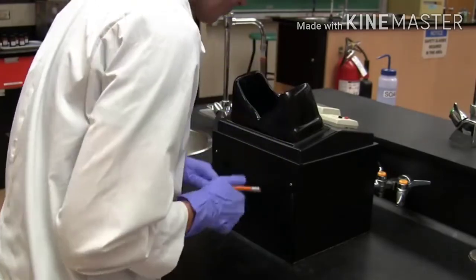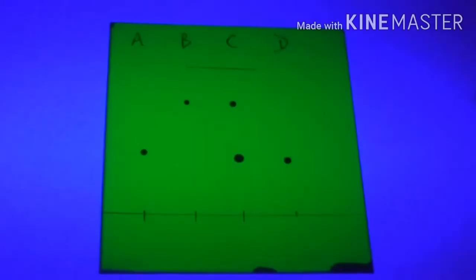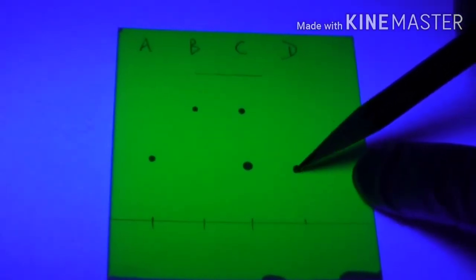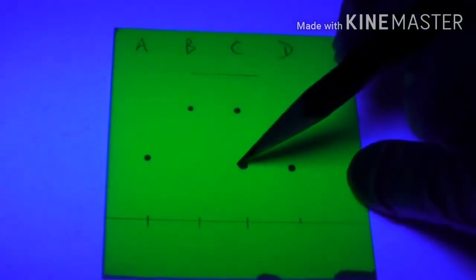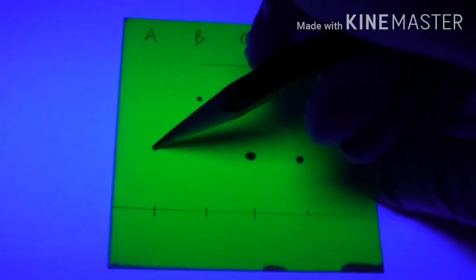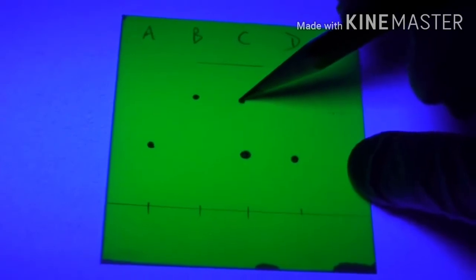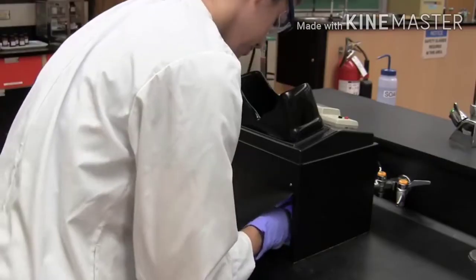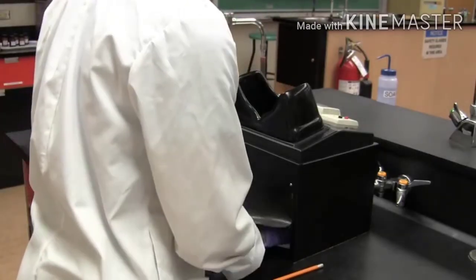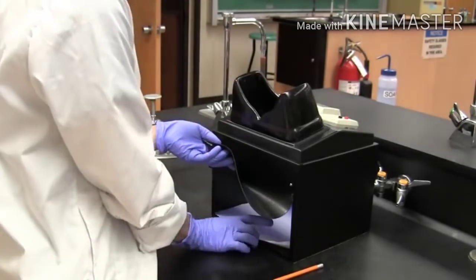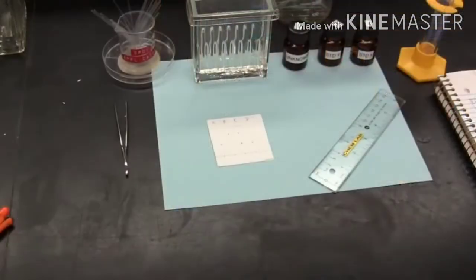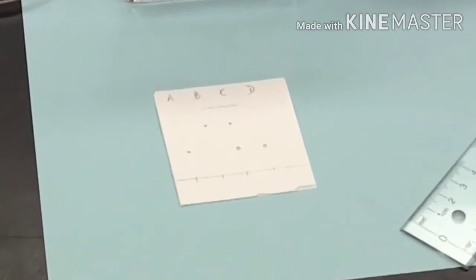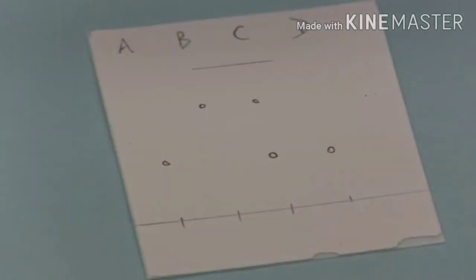So while visualising the plate under UV, we are now able to outline all the spots with a pencil, so that we can locate the spots under visible light. And once all the spots are outlined, we can remove the plate from the UV light box. And now that the plate is no longer under UV light, we can see all the spots together with the solvent front. Let's take a closer look at the results.